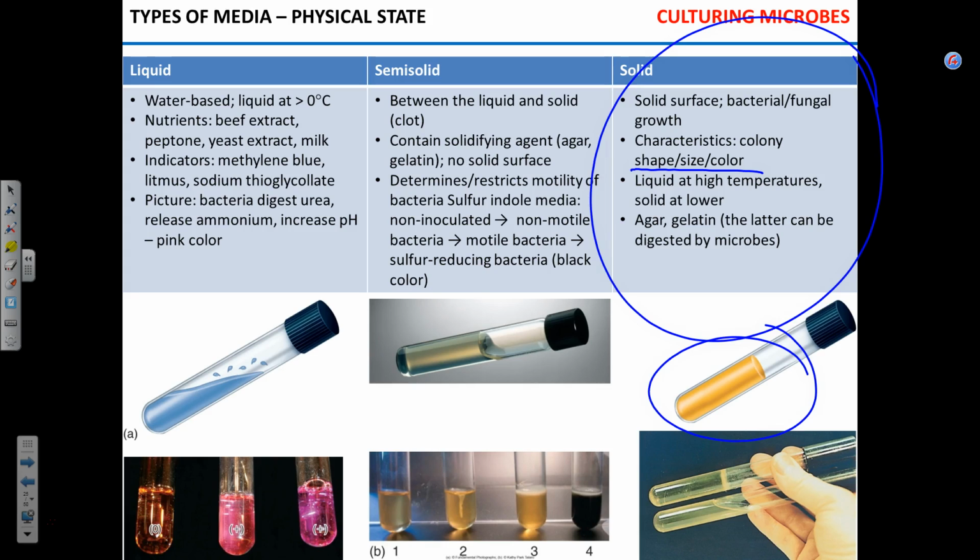It's all liquid. Agar, when you heat it up, becomes liquid in water. Okay. And you pour it in the plates, leave them out on the table for a couple of hours. They cool down, and as it cools down, it solidifies. There you have your agar. So if we take those plates and throw them in the autoclave, agar will melt. Okay? Something like this you can do at home.